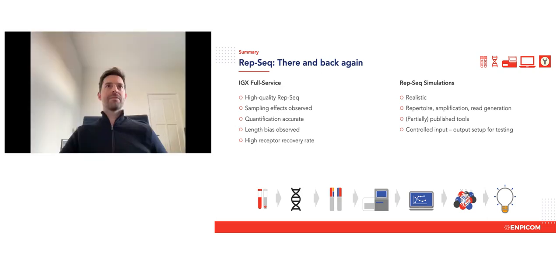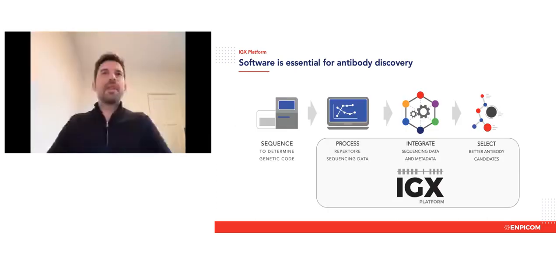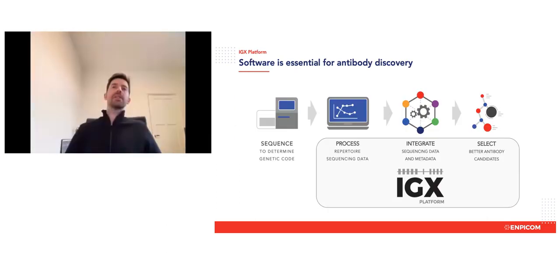All right, thanks a lot, Henk-Jan. Yeah, thanks for explaining all the details that go into setting up an accurate and most of all reliable repertoire sequencing service. Of course, as we already mentioned, next to the sequencing itself, the processing of the raw sequencing data is of paramount importance to a proper downstream analysis.